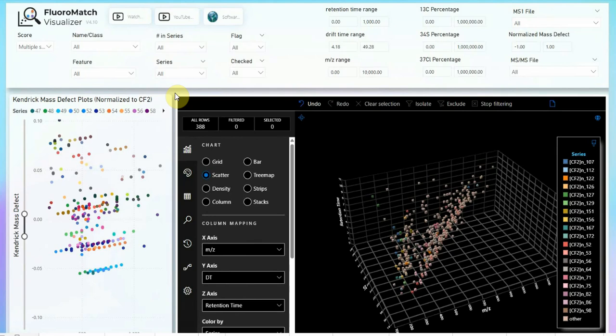So you take an LC IM mobility DIA data file, and then PNNL's preprocessor does some deconvolution, generates an LC DDA-like file, and then, as we discussed in previous tutorials, you can then use that in a two-part process using FluoroMatch IM and a modular script within FluoroMatch IM to generate all the data needed to get both MSMS identifications and IM mobility identifications, which is very exciting.